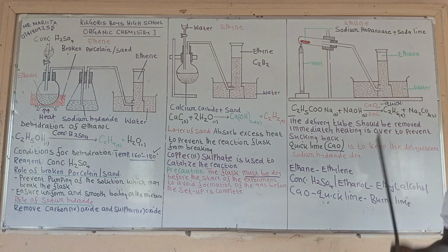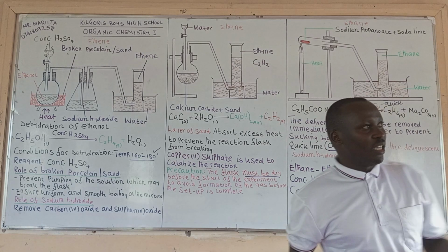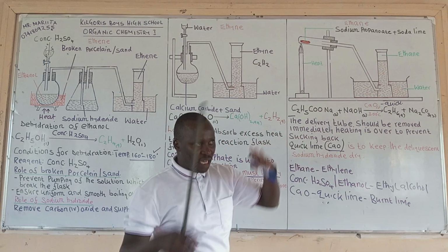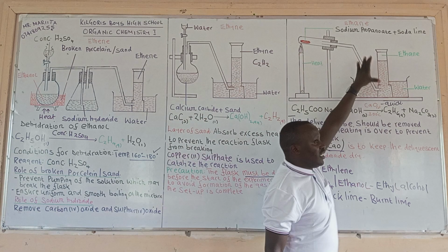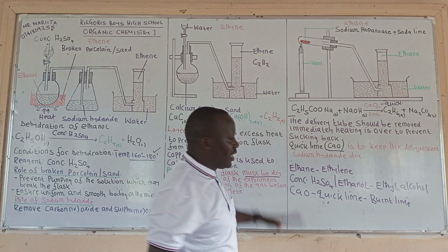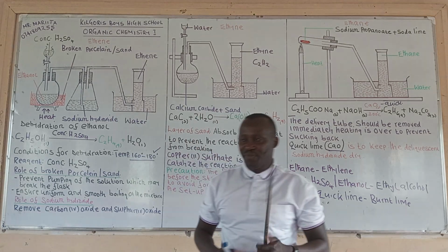Again, one precaution you are supposed to take in this experiment is that the delivery tube should be removed immediately heating is over, to prevent sucking back. Then the gas is collected by downward displacement of water. That is a simple summary of the preparation of this gas.